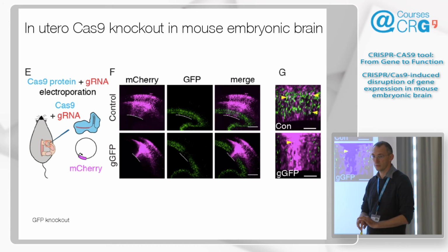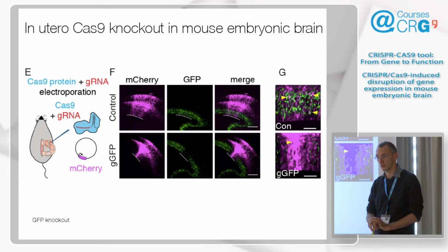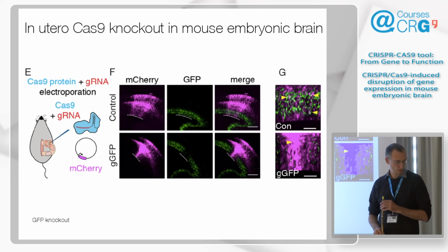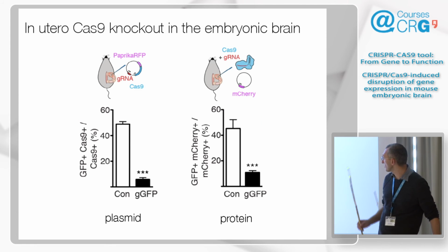We also did a time course at different time points to find out where it's optimal in terms of detection and efficiency. 2 days was also what they were interested in because they care about this stage, so they had to inject 2 days before the stage they care about. In this case, it's just a reporter, but as you see, this is the quantification.